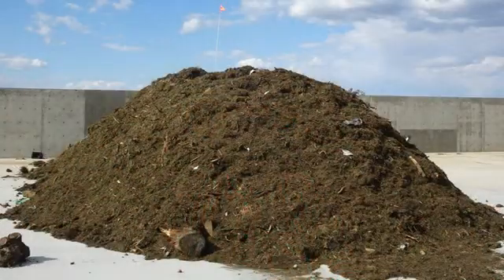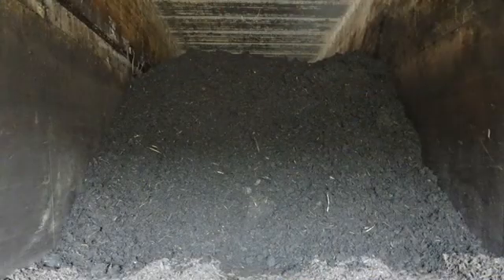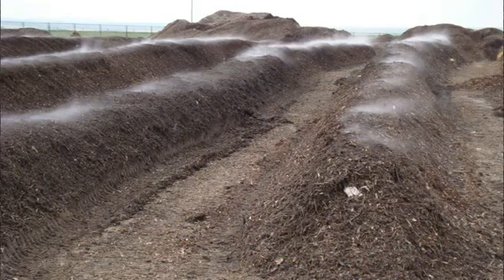Measuring bulk density of compost is important for a number of reasons. It's important for converting weight to volume, such as how many tons of compost are in a windrow or a bin, or how many cubic meters of compost fit into a truck with a given weight capacity. Measuring bulk density also provides an estimate of the ability of air to flow through the material to provide enough oxygen for the composting microbes.